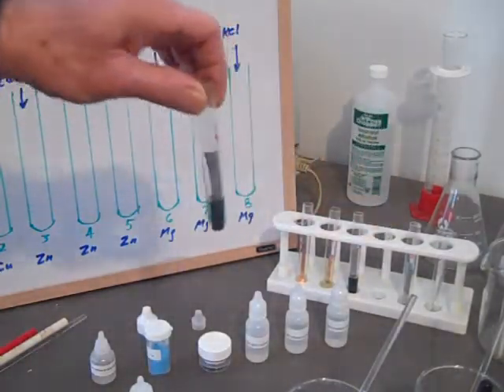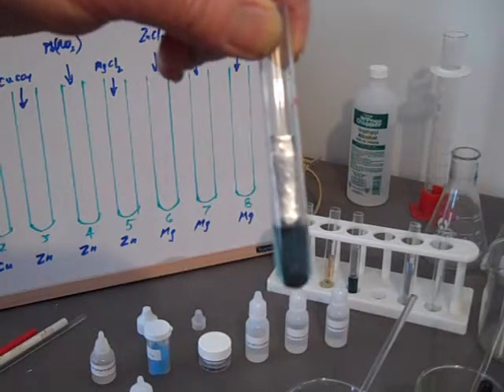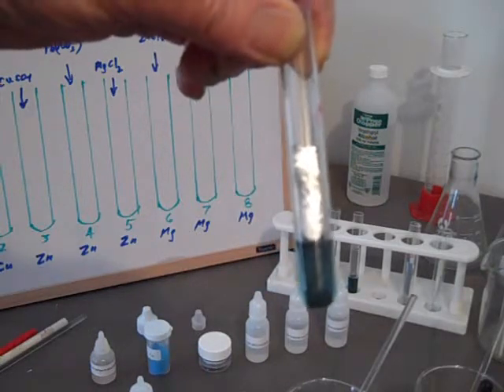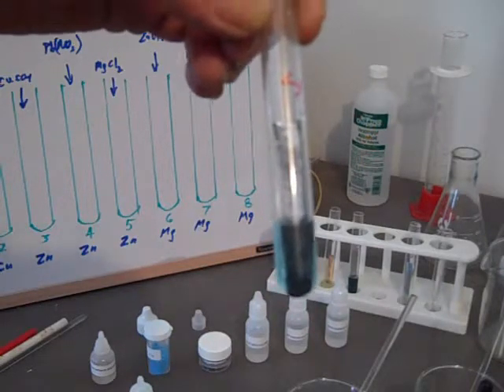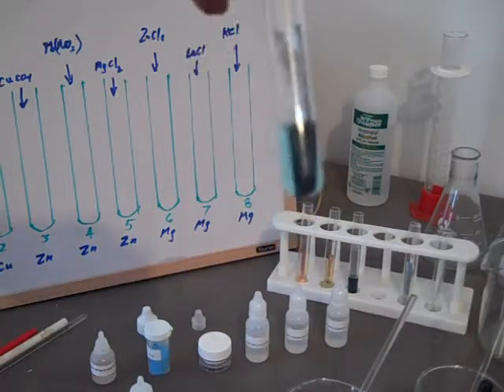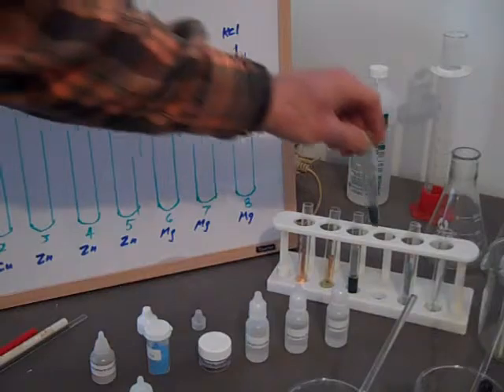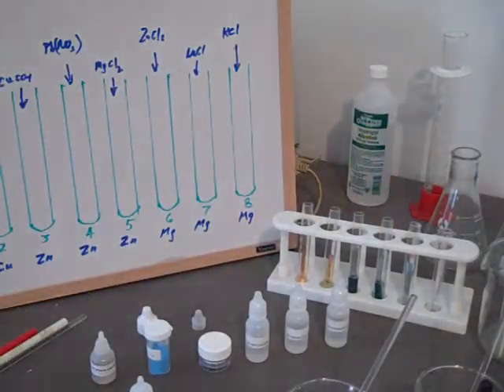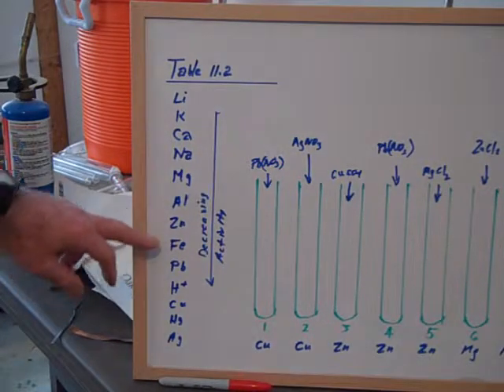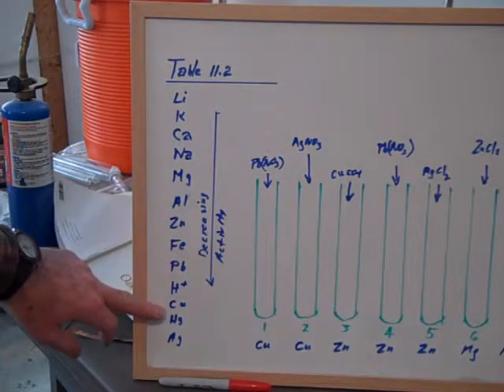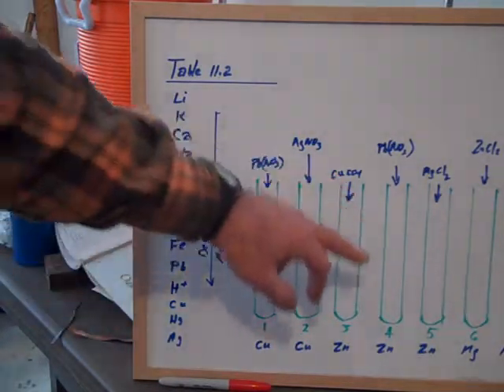We just had some battery failure here. Put in new batteries. It didn't take but 30 seconds. But you can see I had just put the lead nitrate into the test tube, test tube number 4, with a bright zinc strip. And you can see how dark it is on the bottom. That will be the lead plating out on the zinc. Let's take a look again at our activity series. Zinc is here. Lead is here. Copper is here. So the zinc replaced the copper. Then it replaced the lead.